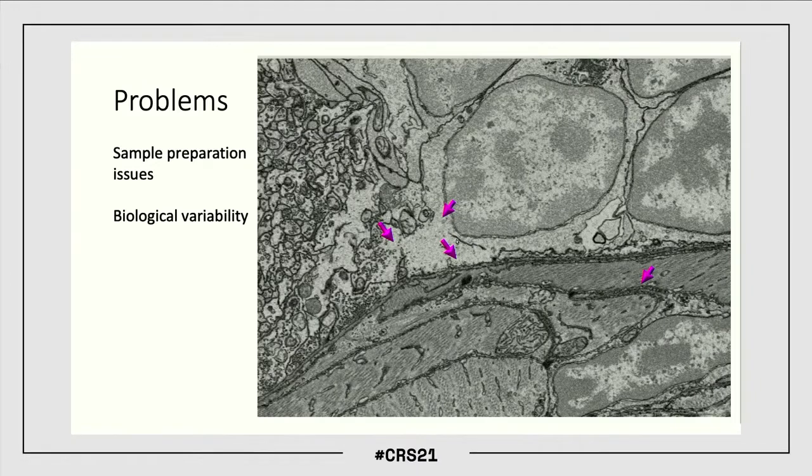Other people will do it for us. So here, we would have to collect the training data for all the possible ways these membranes, or separators of cells, can look. And this is not feasible because collecting this training data is extremely expensive. You have to have professional biologists who would sit down and actually paint on these images in 3D. It takes months of time. It takes tens of thousands of euros to create enough training data to even get to the state where we are now. So creating more is just not possible.